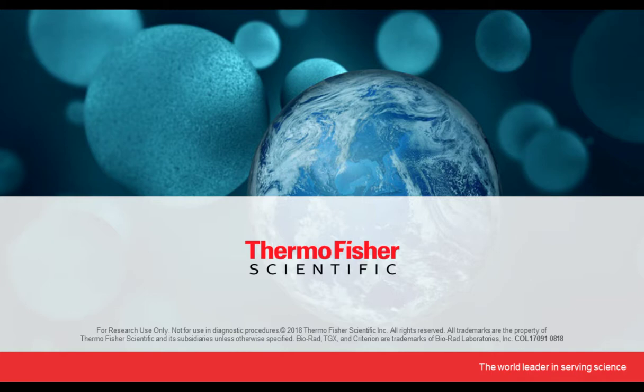So yeah, that's a good question. As we discussed today, the sample prep, again, is an important consideration for any successful gel electrophoresis or an ideal gel electrophoresis run. So having your bands wavy can depend on multiple contaminants that can be introduced during sample preparation.